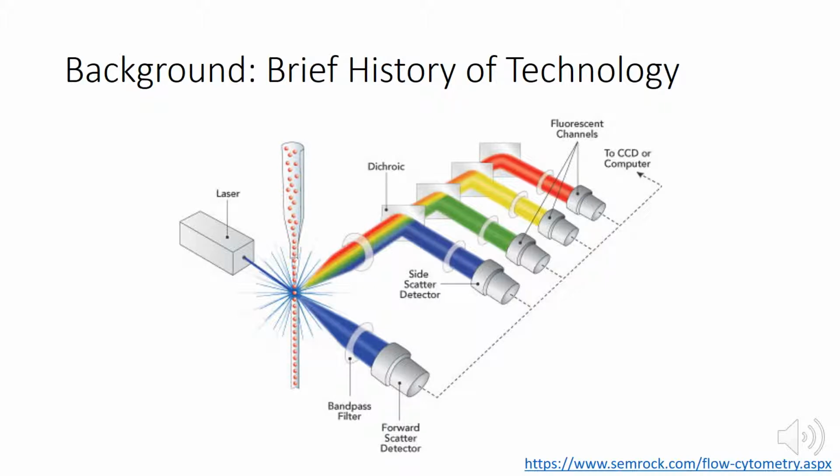Flow cytometry has been around for over 20 years, helping to make advancements in many fields, including oceanography, stem cell biology, immunology, and many others. In oceanography, flow cytometry is useful for distinguishing changes in plankton throughout the seasons and the ocean's regions as a useful assessment for the ocean's climate change. In immunology, flow cytometry helps with immunophenotyping, or quantifying the different types of cells in a heterogeneous sample.